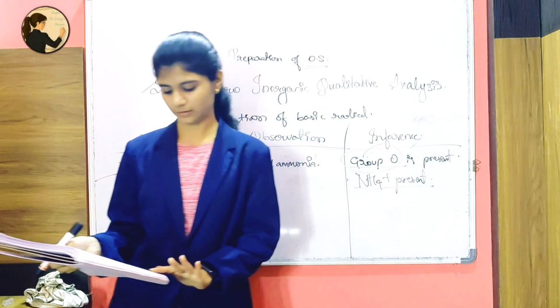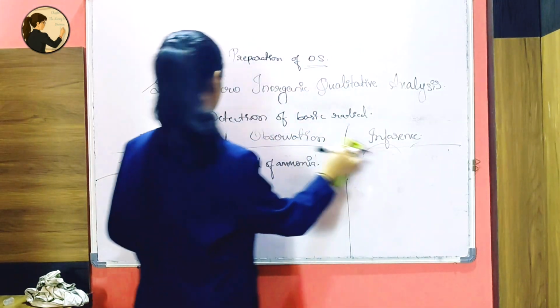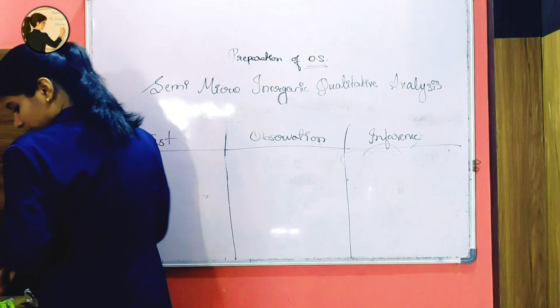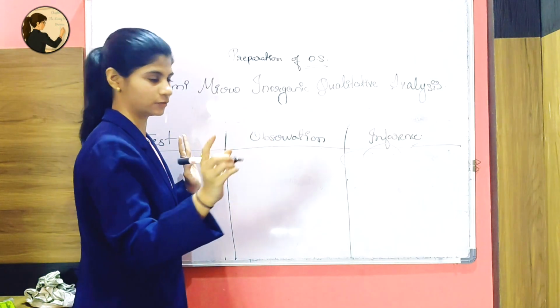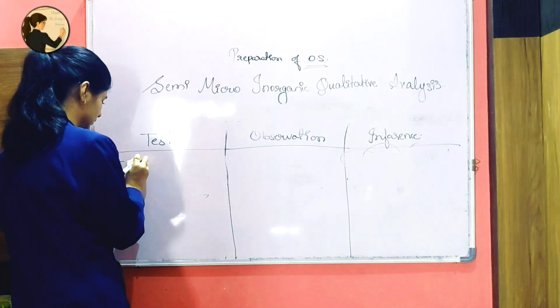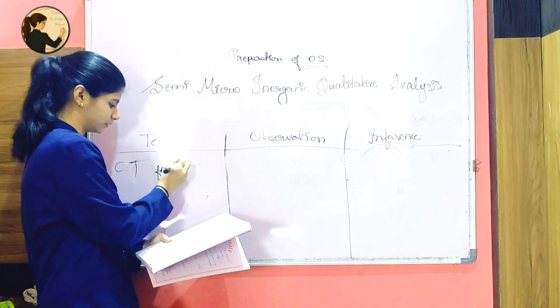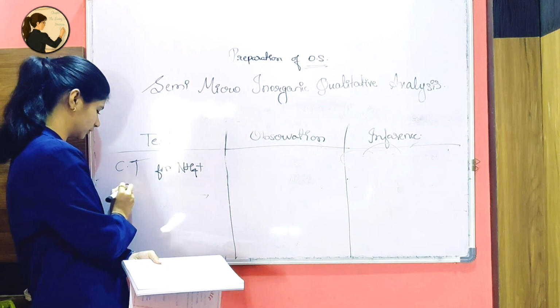Okay. Then after that, now the group 0 is present. You will write the heading as group 0. Group 0 is present. Before that, CT. CT means confirmative test. In CT what will you do? For confirmation of NH4 plus, salt plus Nessler's reagent.